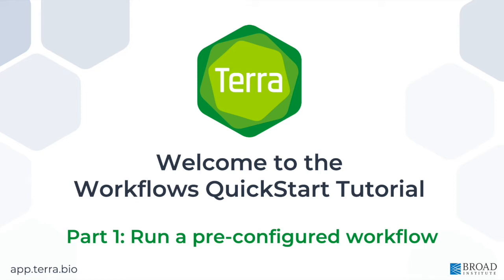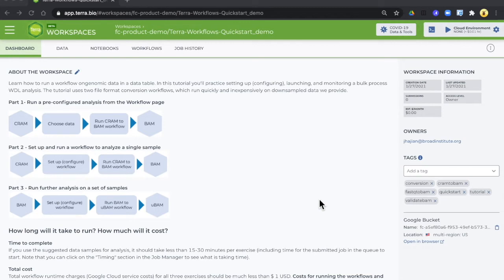Hi, welcome to Terra. I'm Allie from the Terra team and I'm going to walk through part one of the Workflows QuickStart. Hopefully you've already copied the QuickStart workspace.